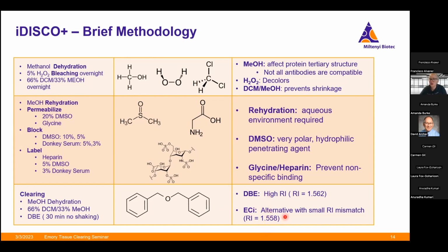I just want to jump in here and say on the ECI that we are doing, all of our organic cleared samples are going to be imaged in ECI. So everybody is ending up in ECI at the end, please. Yes. Okay.